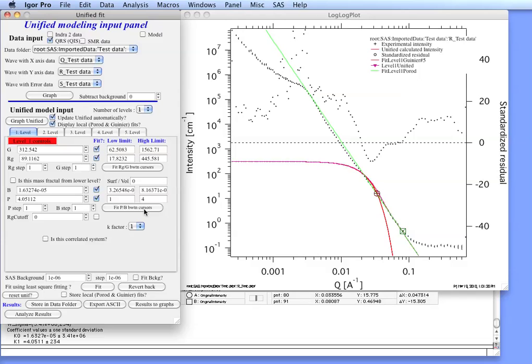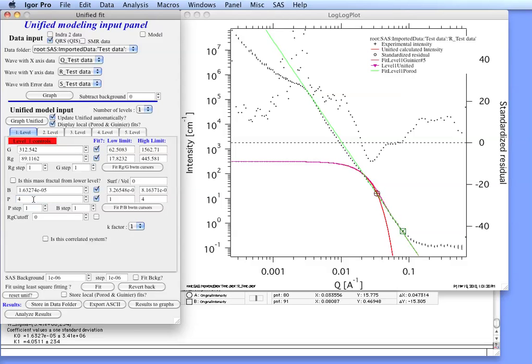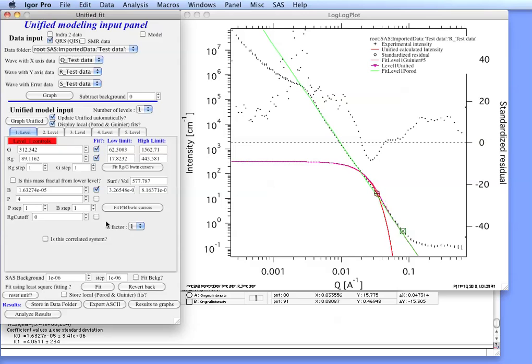Okay. Now you can see that P is 4.05. Actually in this case because these are smooth solid particles we can set this value to 4. And we can actually uncheck the checkbox for fitting. And that way we'll keep it fixed at 4.